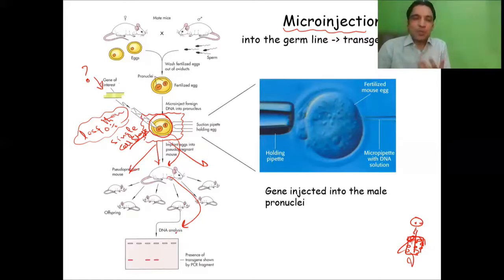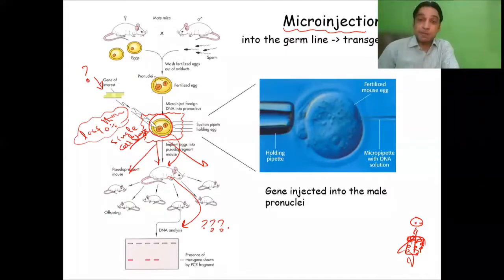This is the time when you come to know whether you have successfully incorporated the external piece of DNA or not. And there are a lot of troubles associated, because you don't know where that external piece will be incorporated. हमें नहीं पता कि वो कहाँ जाएगा. It can go, but अगर वो चला गया है, you might be able to know after that, not at that time when you have done that experiment.